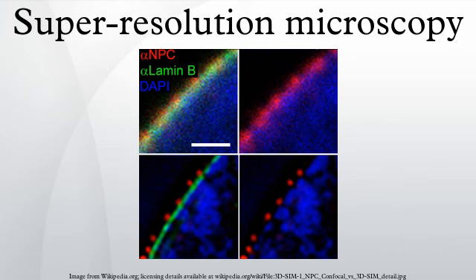damage to the sample. Ground state depletion, GSD microscopy, uses the triplet state of a fluorophore as the off state and the singlet state as the on state, whereby an excitation laser is used to drive the fluorophores at the periphery of the singlet state molecule to the triplet state.